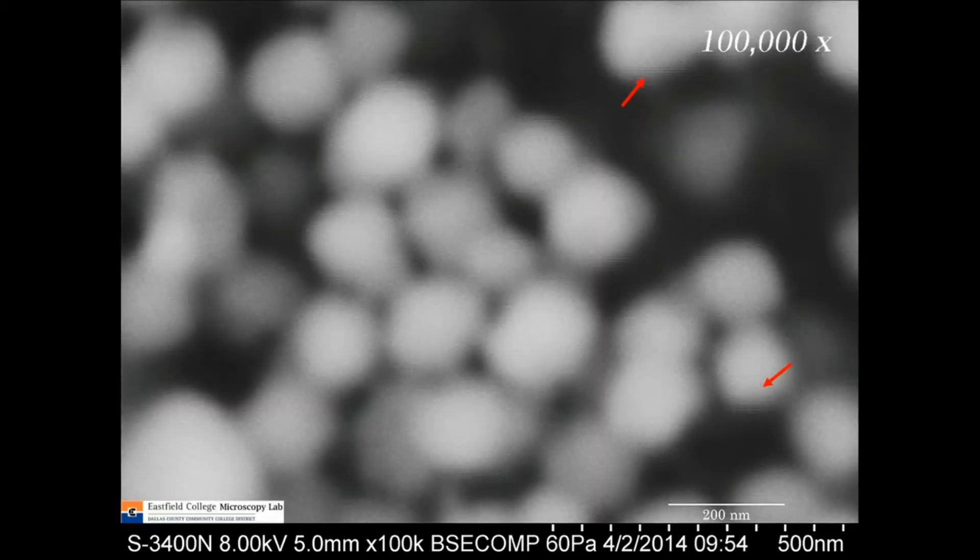I want to show you one last image, taken at 100,000 times magnification. I wasn't real happy with this — I kept getting these little lines across the image. My lab happens to be on the third floor of the building, and as classes were changing, students would go back and forth up the hallway. As they were walking, it was shaking my scope enough that at 100,000 times magnification I was getting these little lines. I hope this allowed you to somehow relate an everyday object, such as an email, to what we do in the microscopy lab. And I also got to throw some math in on you. So I hope you didn't mind.